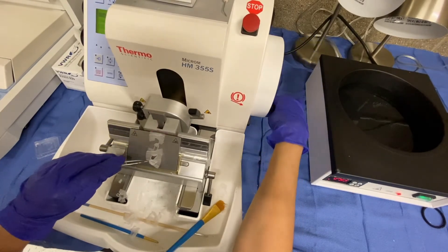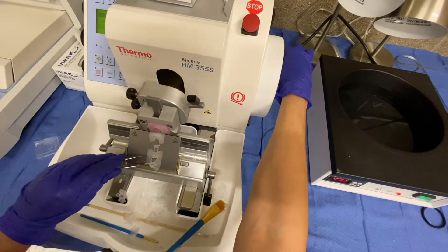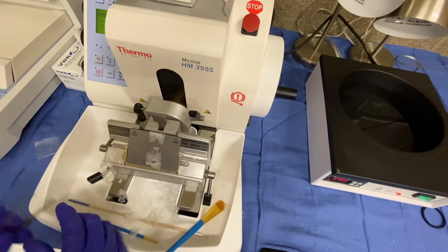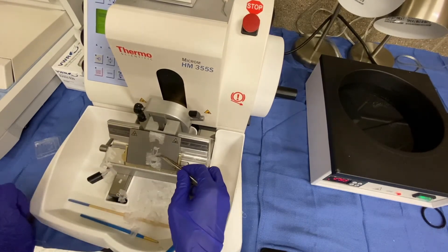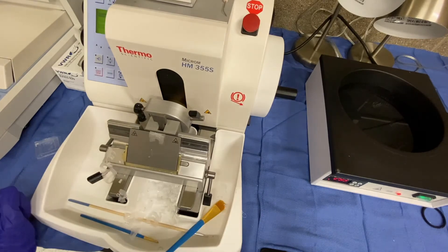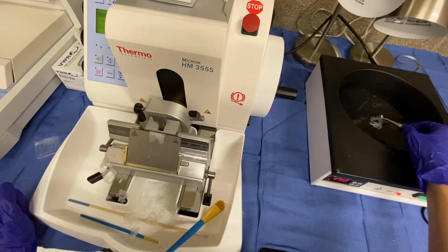As you can see, I'm starting to get sections here on my ribbon. What I'm going to do is use my forceps to lift the ribbon and place it into the water bath.